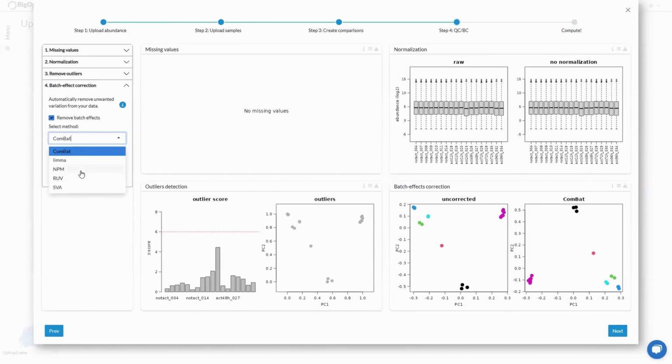With the unsupervised approaches, everything will be done automatically. So there is nothing that you need to specify here. But they will also tend to apply more drastic changes to the expression profiles that you get in your genes or the abundances that you get in your proteins.